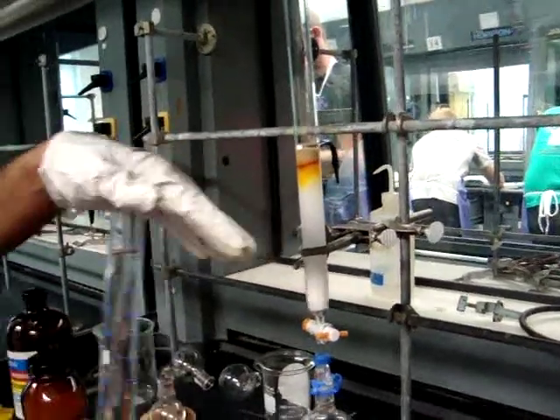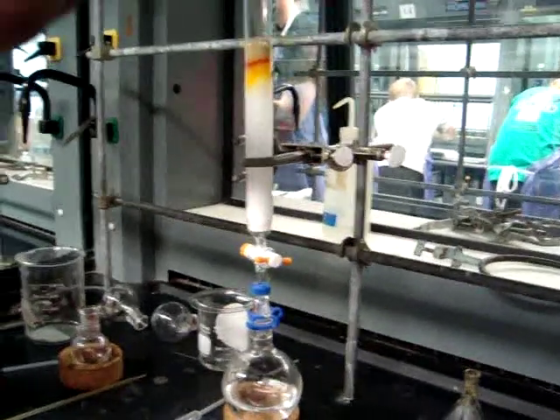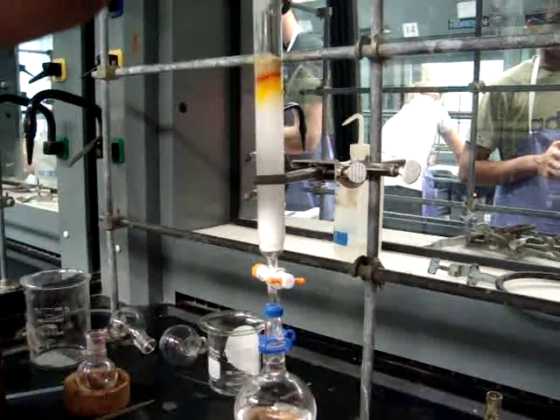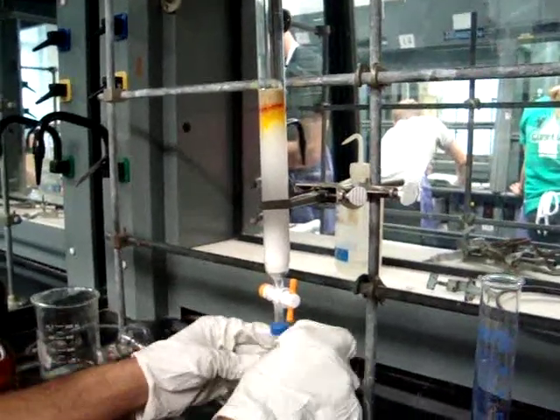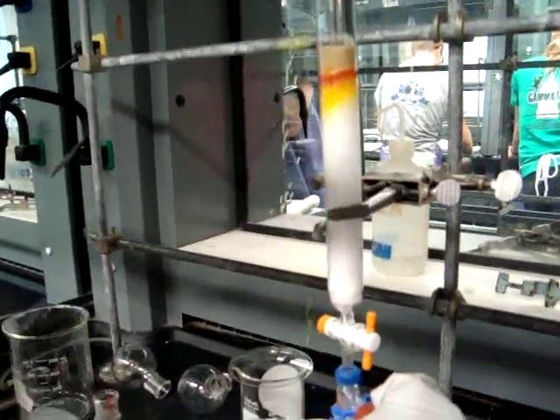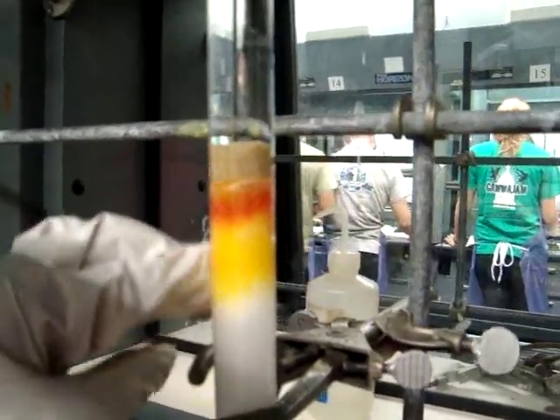You will then increase the concentration of the solvent by adding a mixture of 10% dichloromethane and 90% pet ether. Add this new solvent to the column. Then reattach the vacuum and open the stopcock to drain the solvent from the column.